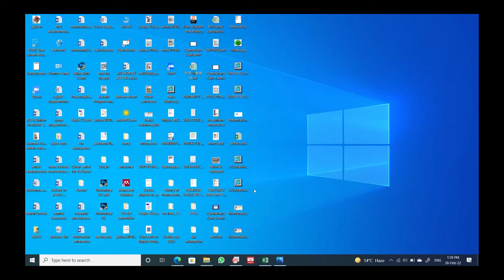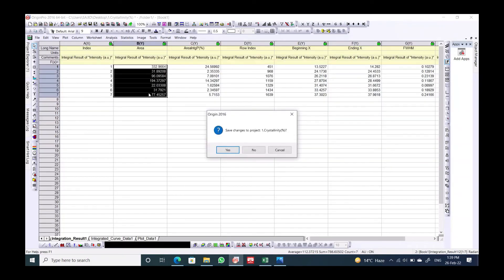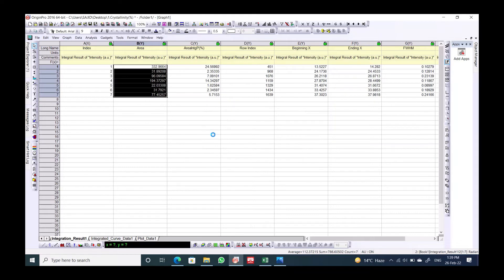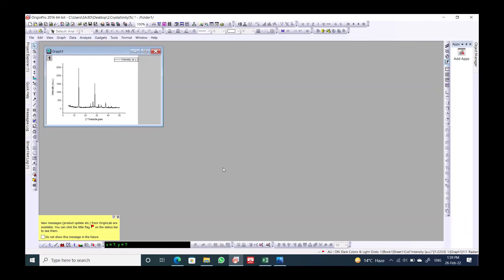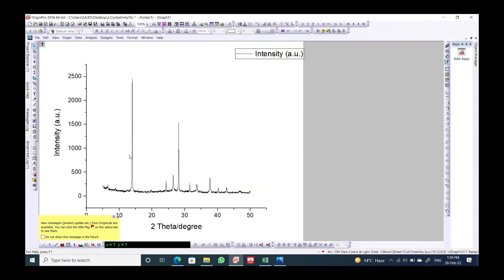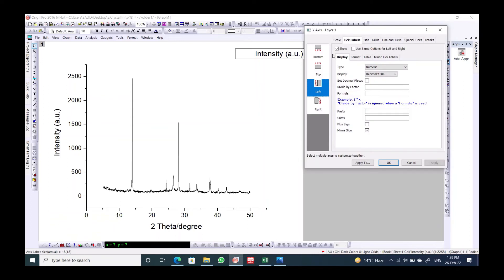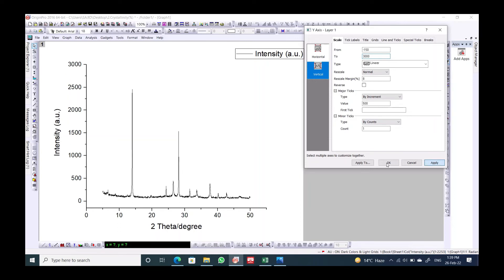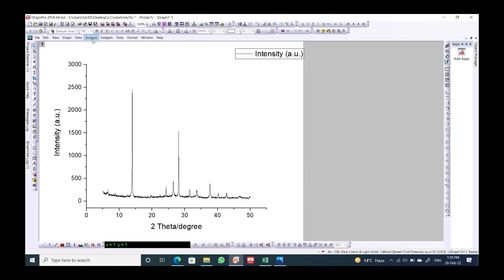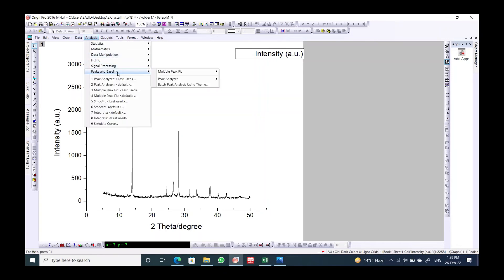For the second step, draw the graph again to start fresh. Once the graph is ready, go again to Peaks and Baseline, then Peak Analyzer, and open the dialog in the same way.